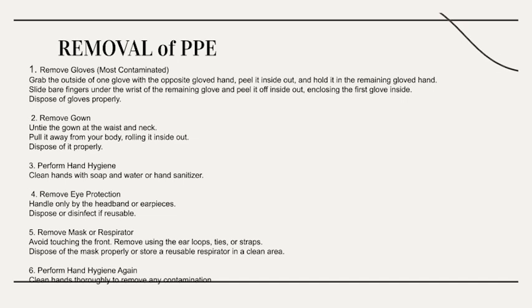Remove mask or respirator. Avoid touching the front. Remove using the ear loops, ties, or straps. Dispose of the mask properly or store a reusable respirator in a clean area. Perform hand hygiene again. Clean hands thoroughly to remove any contamination.